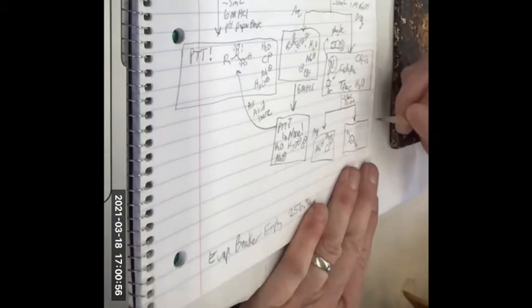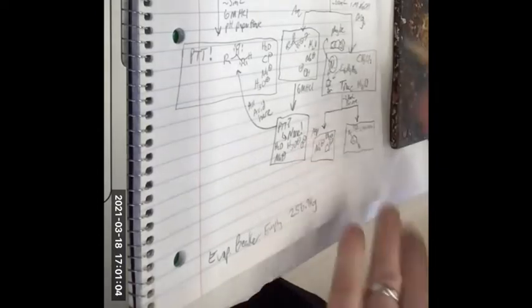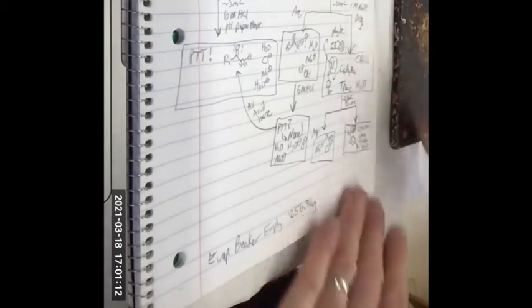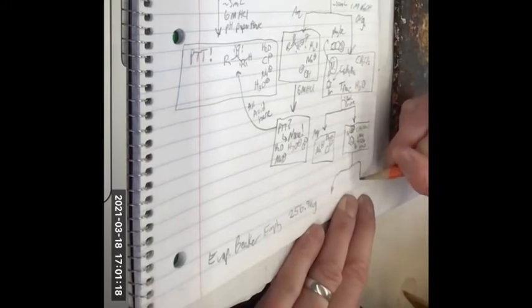Okay, I got that. And then the methylene chloride, the neutral compound. Oops, it's ugly. And then the very trace water, just a little bit of water left. What do we do with that? How did we do our final dry?